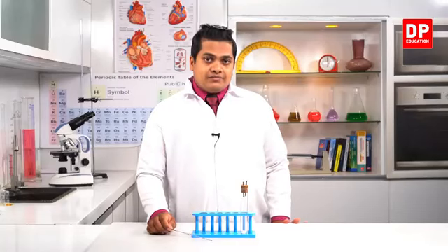To conduct this activity, I have prepared a setup by using two stands, a water trough, and several boiling tubes.